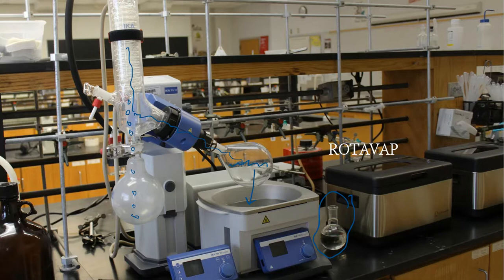So we recycle in the lab. We don't trash everything. We don't evaporate everything off. And here's one of those times where we don't do that.